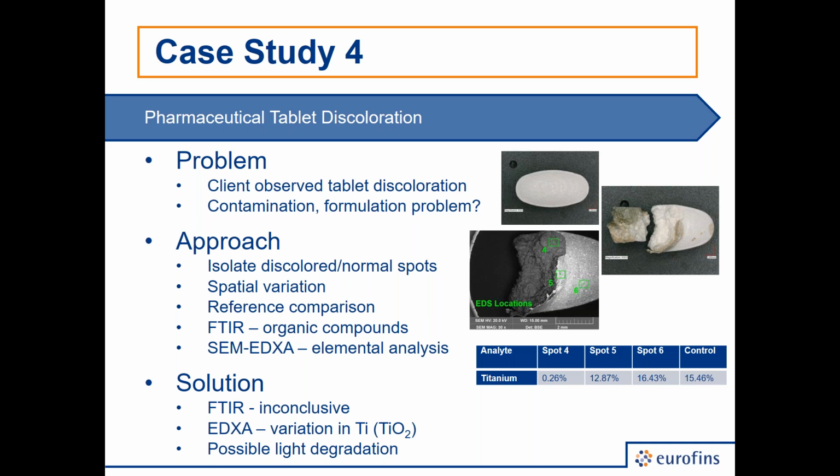And this is a problem for them, not just because it looked unsightly, but titanium on the surface is a reflective material. And so the lack of it on certain areas of the surface could lead to light degradation for the product. And so it was ultimately recalled.